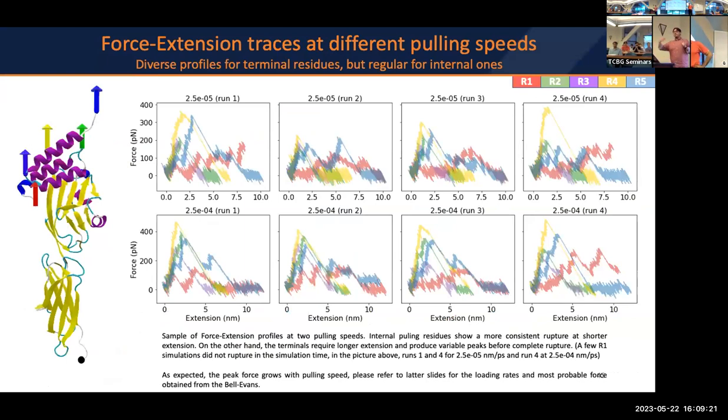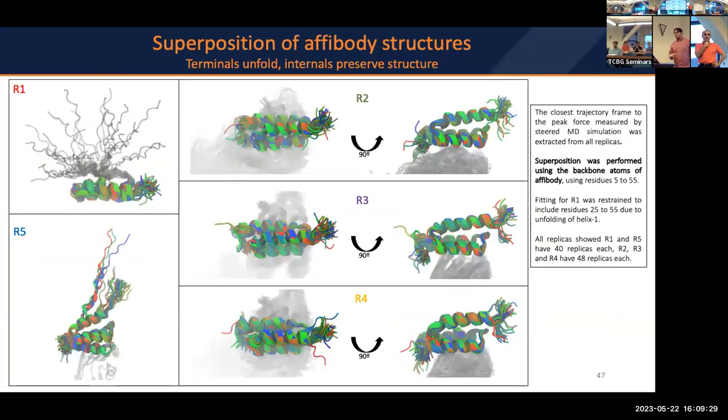Okay. Yeah, you have to run some trials. Especially for the terminals it is awful, because you never know if the protein is going to unfold. When the protein snaps and won't unfold, which is true for some of the cases, you can use a small box and you're safe. But for this one, I had to repeat so many times.